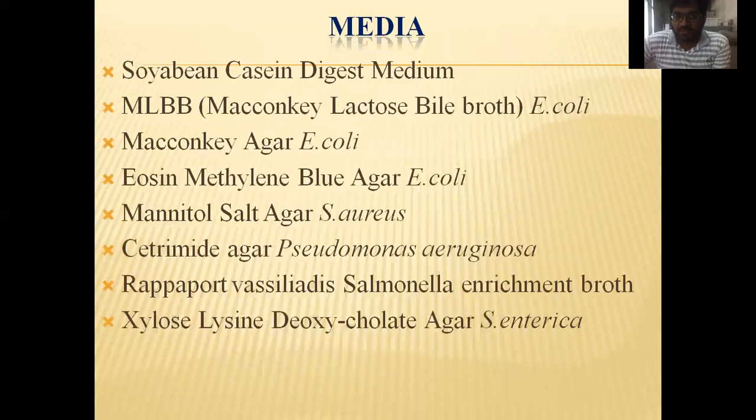Media. You can see there are many media listed, starting from soybean casein digest medium, which is a simple medium like nutrient medium, nutrient broth, and MLBB, MacConkey lactose bile broth, for the E.